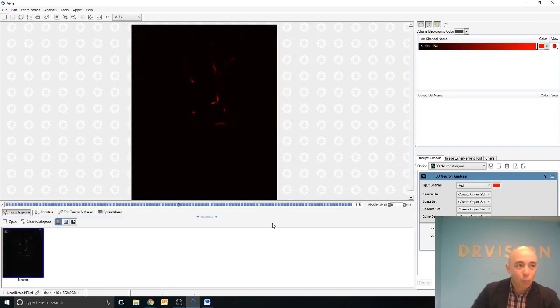Now, once we've loaded this, we can step through it, slice by slice, even play through the entire sequence. Even set at the highest speeds, we can see the neuron in this image sort of begin to take shape. However, playing through it slice by slice isn't exactly what we want now, is it? Sometimes 2D isn't good enough, especially when it comes to representing complex shapes, structures, or geometries.